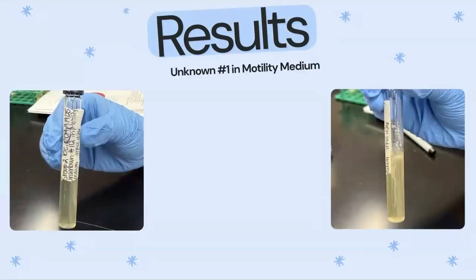When we look at the unknown number 1, it seems that some of the growth was visible on the side of the test tube, which could be a result of not successfully inoculating as precisely as possible, but we still see that there is a linear growth that can be seen specifically on the right photo.